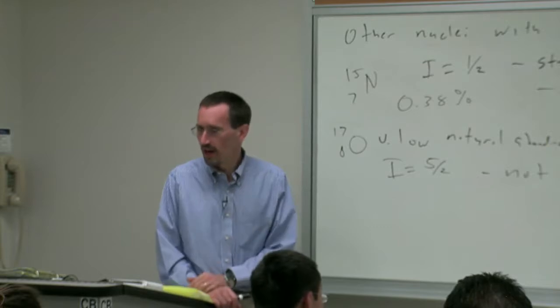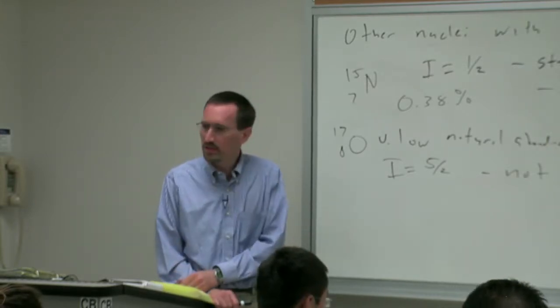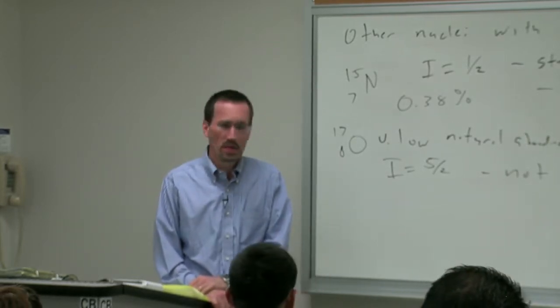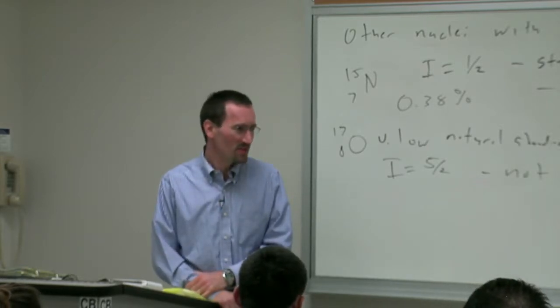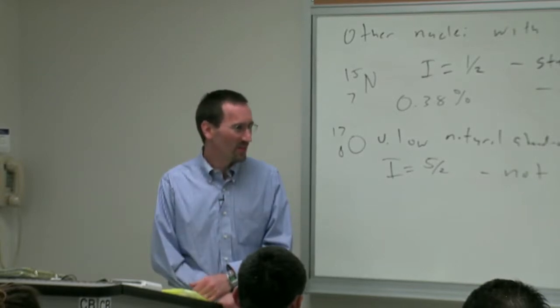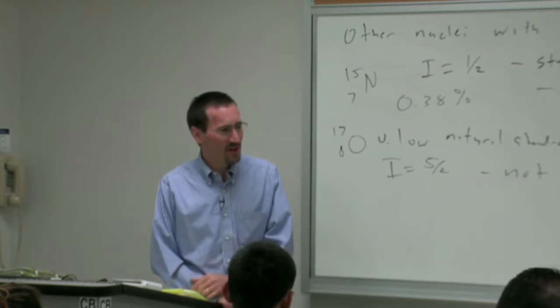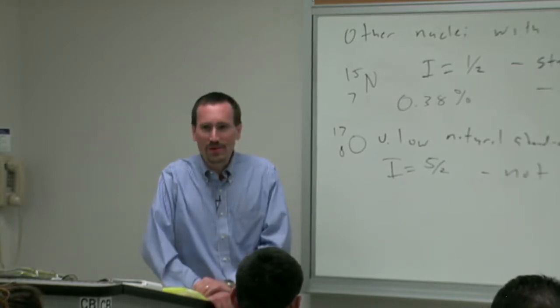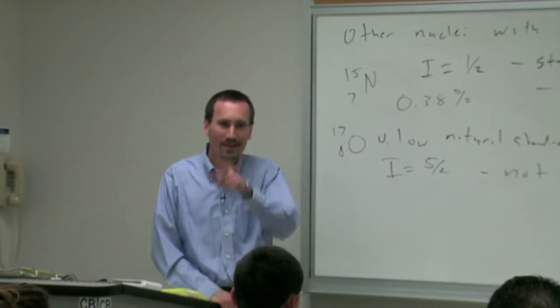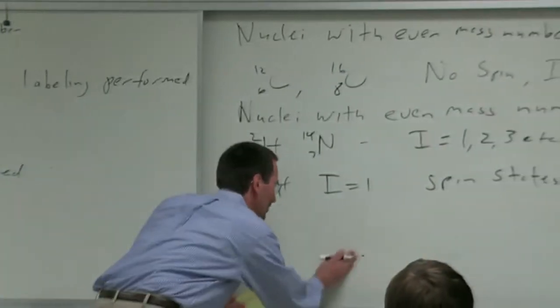Chloroform, right? The first solvent most of us reach for because it's pretty cheap as solvents go and pretty good at dissolving organic chemicals. It's cheap because it doesn't have that much deuterium in it, right? You only have 1 deuterium for all that weight of chlorine. You need the deuterium to get the deuterium lock for NMR spectroscopy. And what do you always see when you run an NMR spectrum in deuterochloroform? A triplet, and a very interesting sort of triplet.